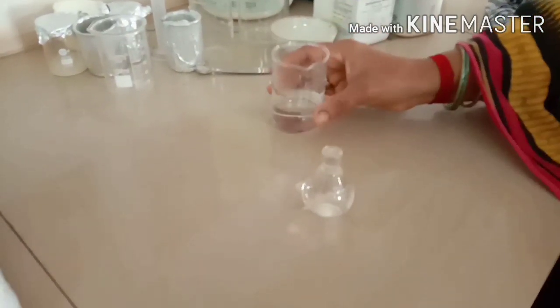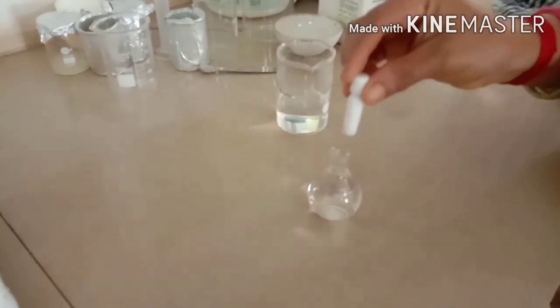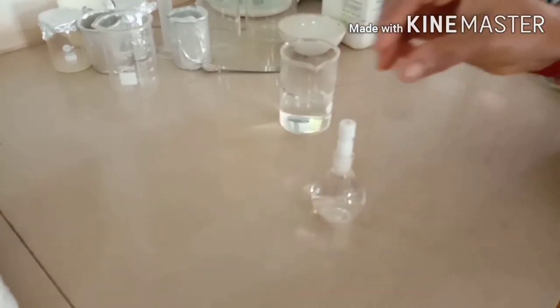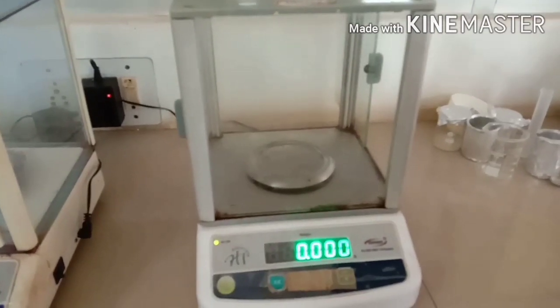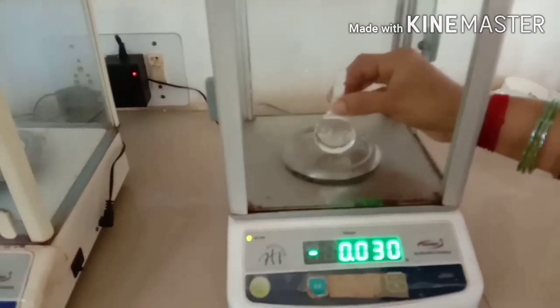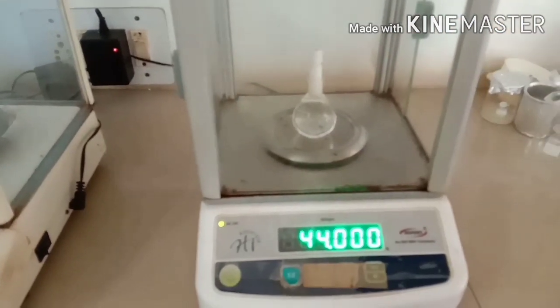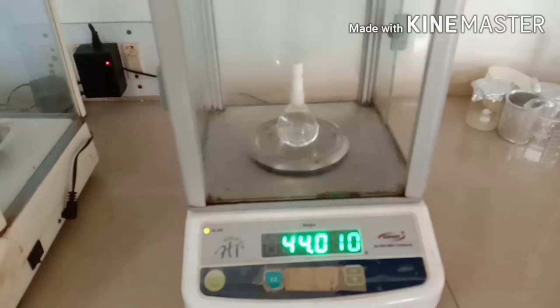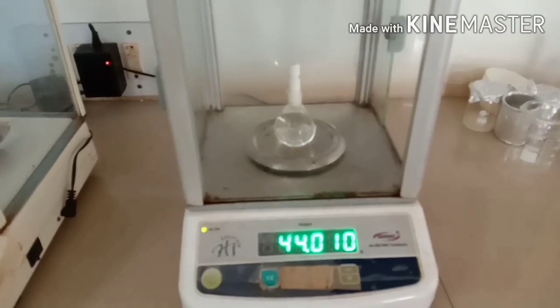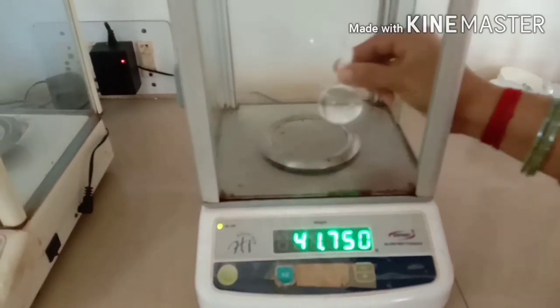That is W2 minus W1 divided by W3 minus W1, into density of water. That will give you the density of unknown liquid. So this is the weight of unknown liquid with specific gravity bottle. Similarly, next substitute this in the formula.